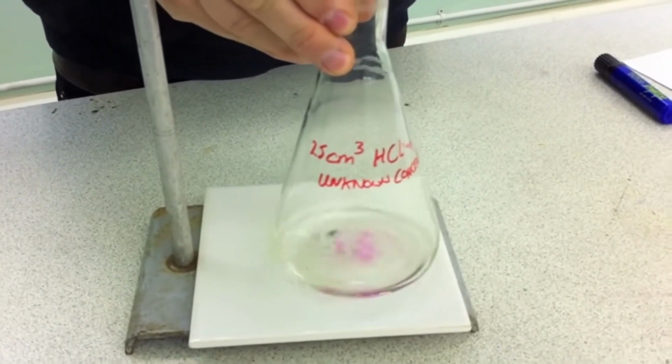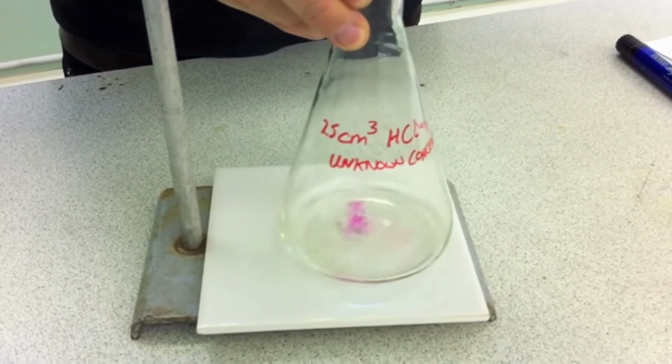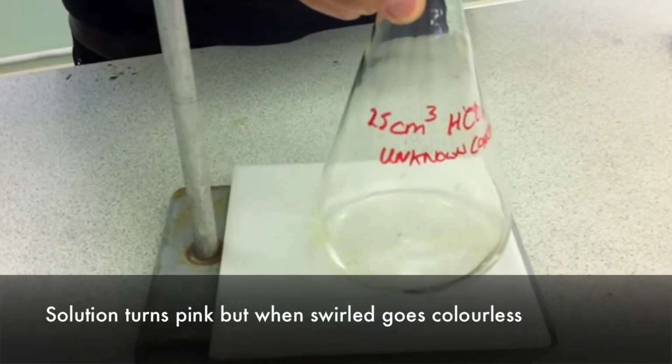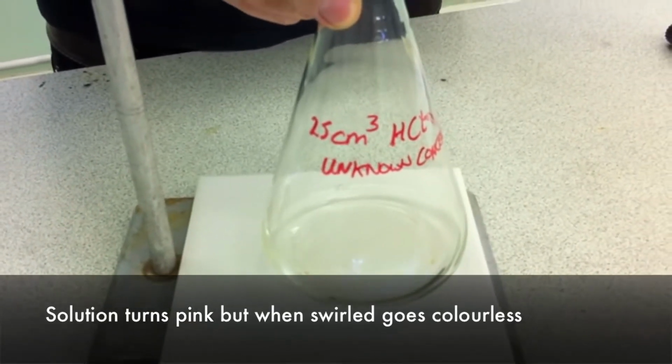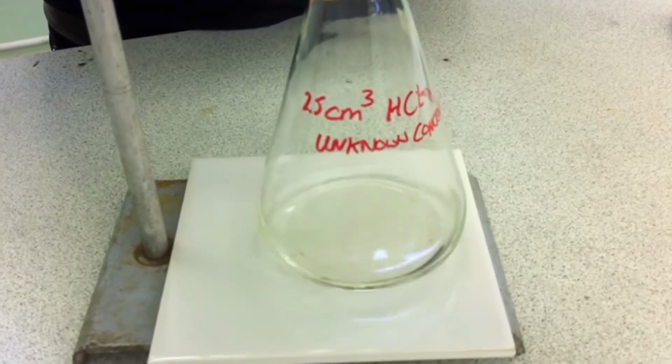I was saying it wrong. I was always going from putting the base in first. You can always go backwards. But you want the solution to be pink colored as your final result.